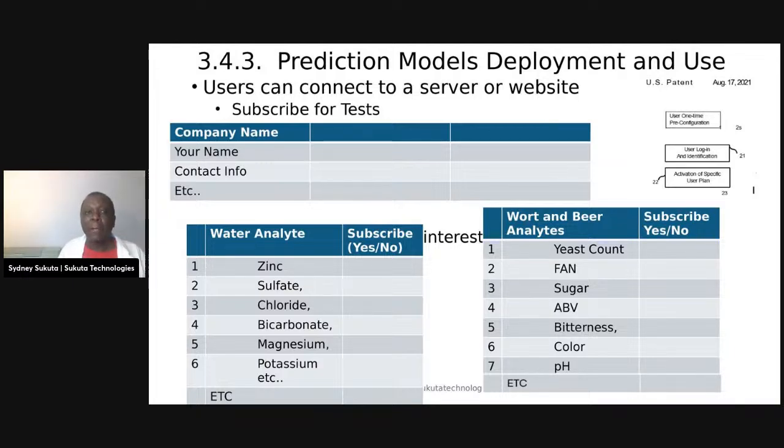And while I'm at it, on the water side, the reason why I got interested in water, first it was beer. Then I said, wait a minute. If the water chemistry is not exactly what you want, you're not going to get the beer you want. So it's very important that the water chemistry is profiled, number one. Number two, once you identify the water chemistry you want, to make sure it's consistent. And this AI spectrometry will do that. It will check and say, this is not the water you used last week. So you can have your water chemistry people do that, or wherever you buy it.